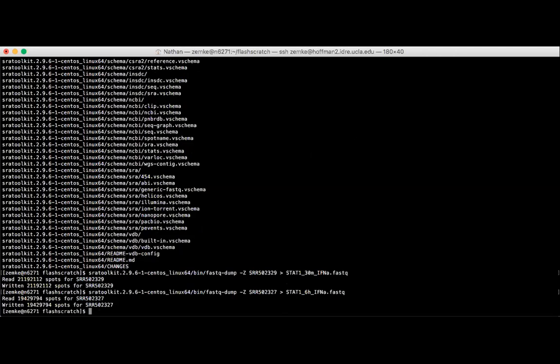And the second one just finished for me, so I have 2 more. So I'm going to do the input 30-minute one.